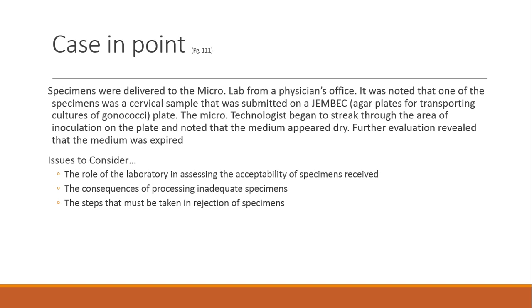So because the media is expired, it's dried out, the nutrients are probably not at their best, you're compromising the results that you're getting if you're not using media that's in date. That makes sense, right? I think Ms. Grimmie's probably going to drill into you using things that are in date, checking your expiration dates. It's all part of regulations that we follow, that what we're using is in date. And a lot of times in physicians' offices, they're given these media and they don't use them all the time and they don't check the expiration dates because they're not as well trained as we are.